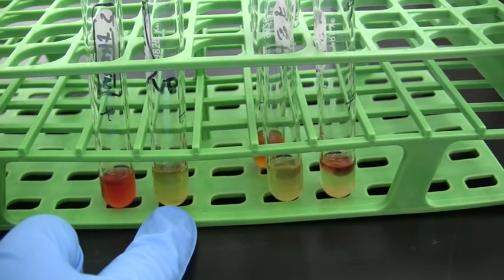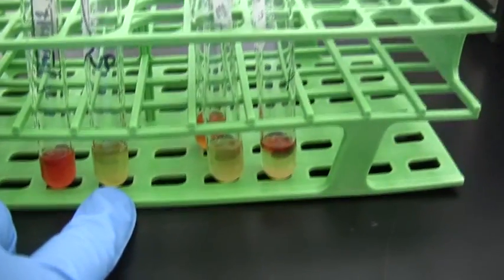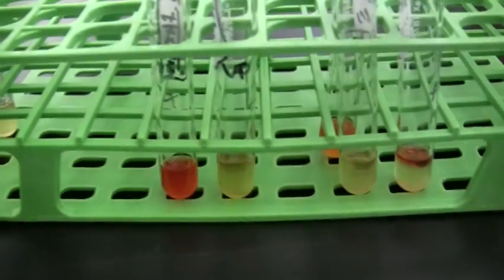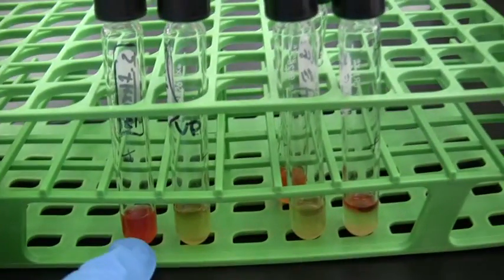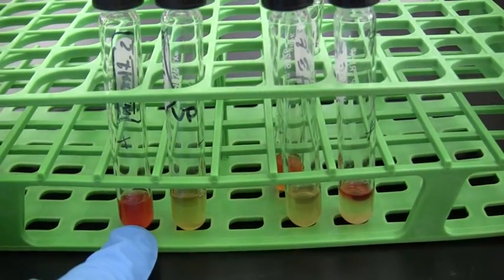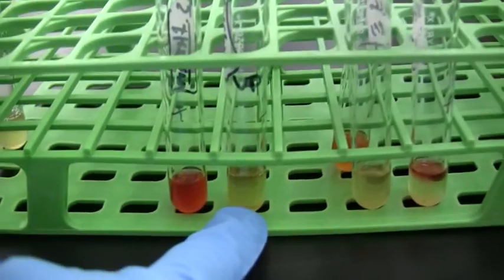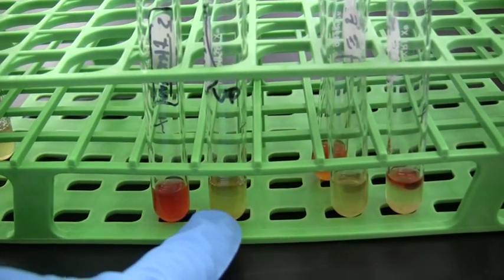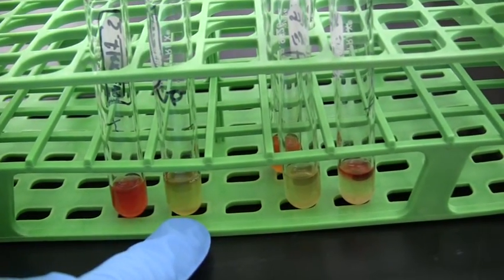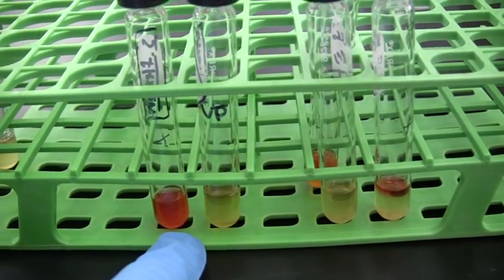And that needs an incubation time of somewhere from 5 to 10 minutes, maybe even up to 15, and that varies a little bit depending on the particular type of VP A and B reagent that we use. Now, you should never see a positive for both tests. What I see here on the left is a positive for methyl red, and that tells me this organism makes acid end products. And I got a negative for the VP test, which also confirms that the end products are not neutral to basic, because I didn't get a positive here. I got a red color in methyl red, which indicates the end product is acidic.